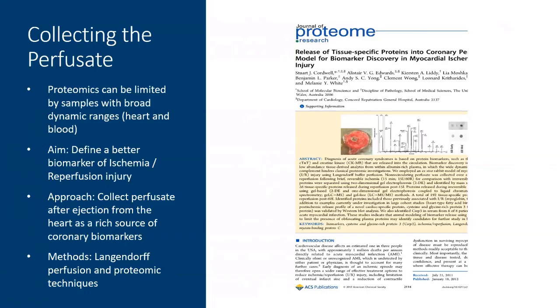So you can imagine when we're doing our proteomic techniques that our ability to see low abundant proteins that aren't associated with either the contractile filament or the mitochondria can become difficult. But then when you complement that with the fact that the heart has a very large volume of blood comparatively, we've got additional dynamic range effects from the blood that is also in the heart. Albumin is one of the biggest problems that we always face in a proteomic study.